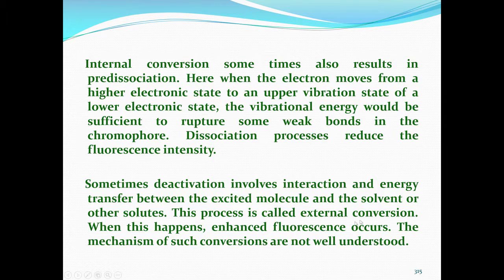So, this is important because it means that with different solvent molecules, if I take butanol, fluorescence intensity will be different compared to methanol or benzene or toluene or something like that. Okay. So, the medium becomes very important in the measurement of fluorescence also. So, the mechanism of such conversions are really not very well understood even now.